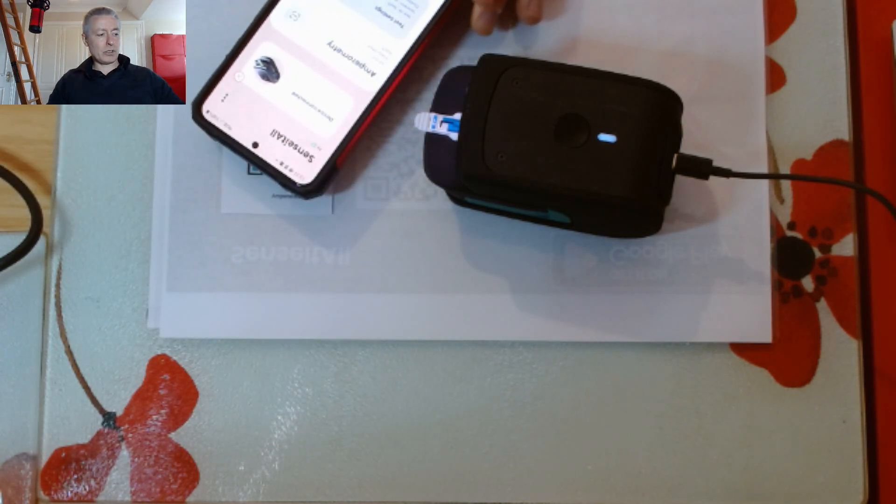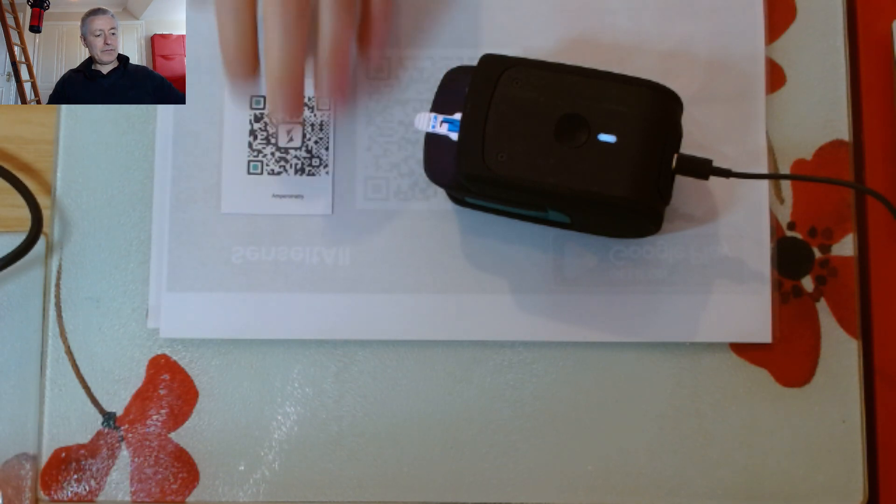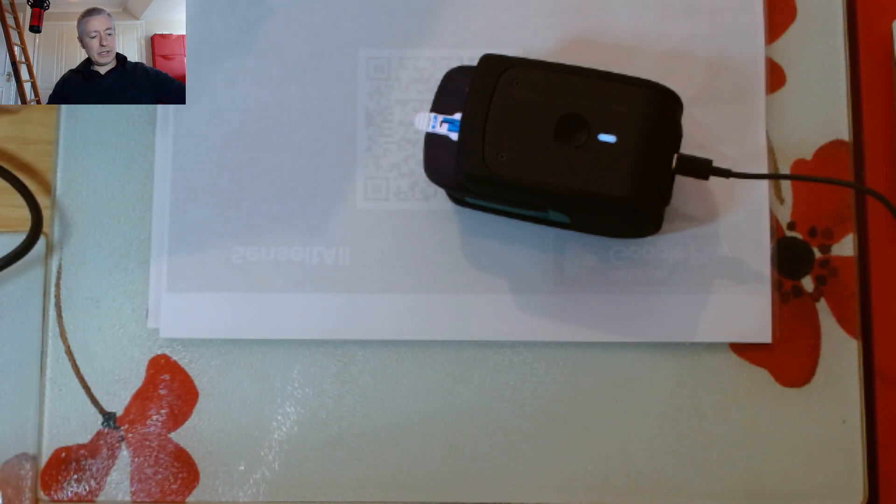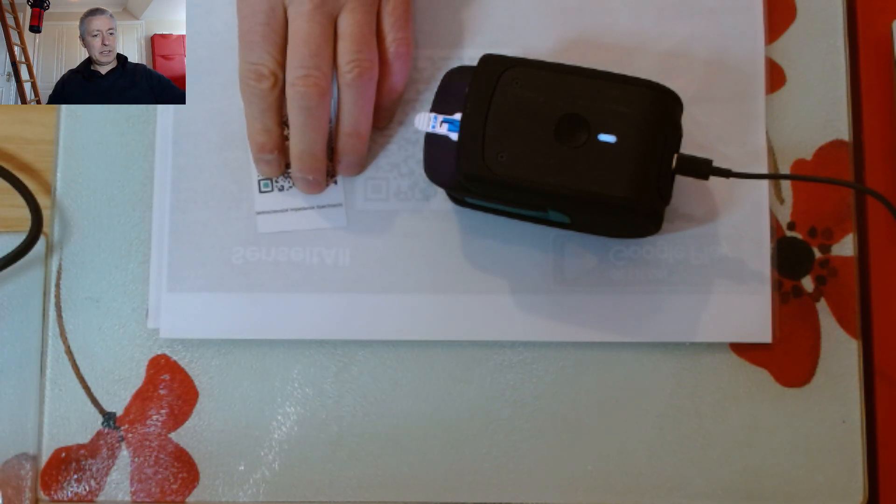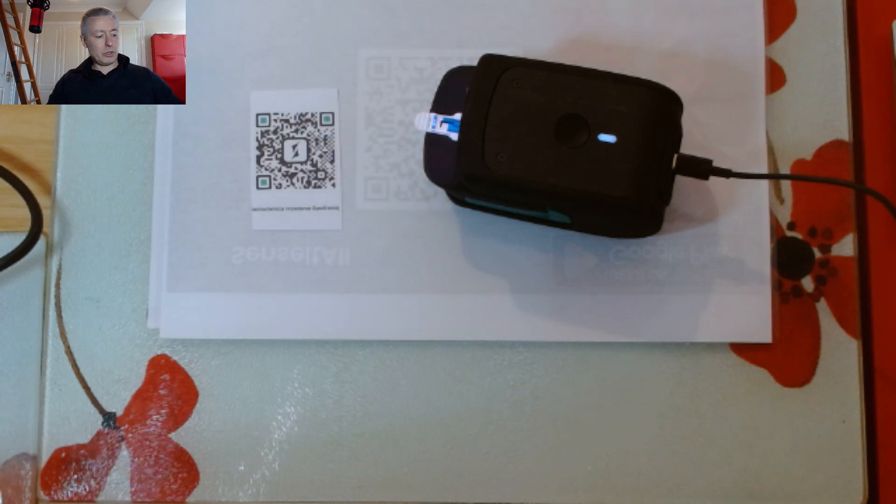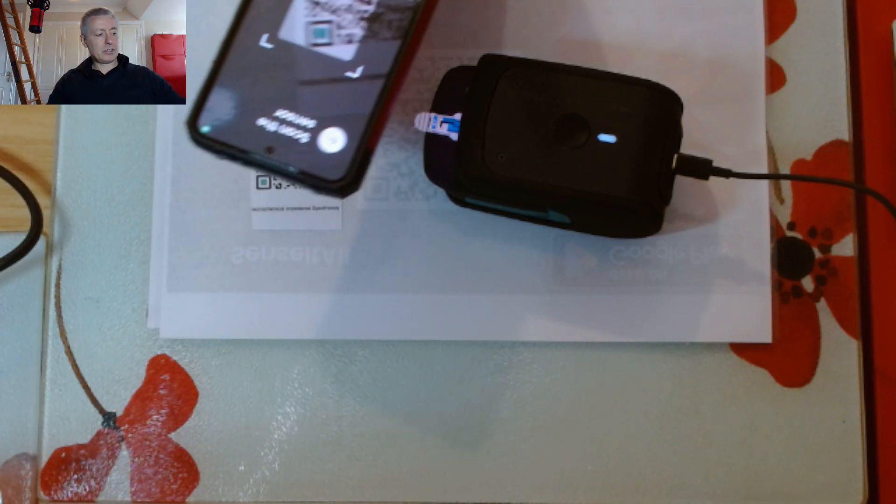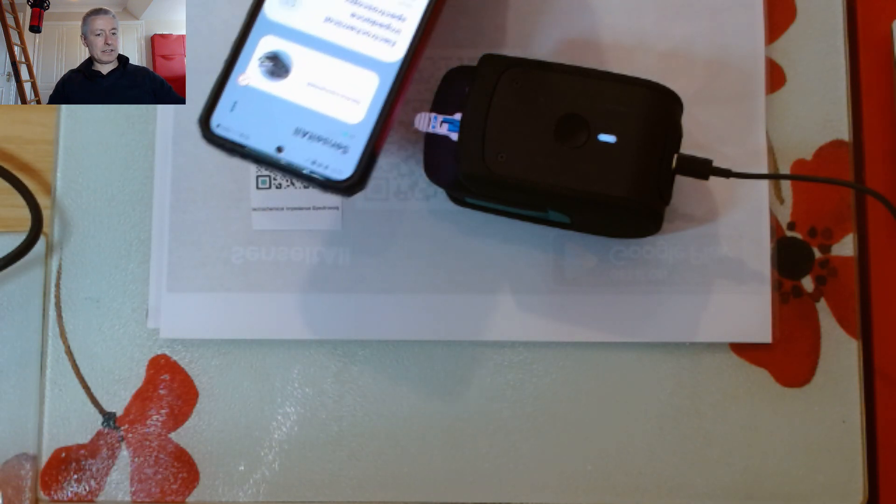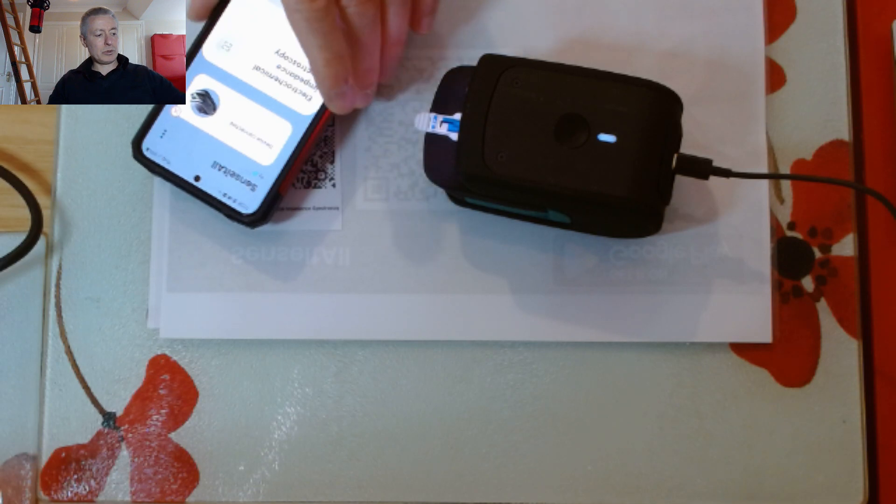If you want to do impedance spectroscopy, there's a QR code for impedance spectroscopy. I can just scan that and it will change to electrochemical impedance spectroscopy.